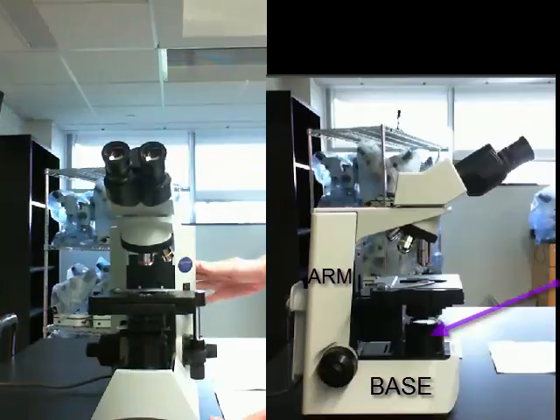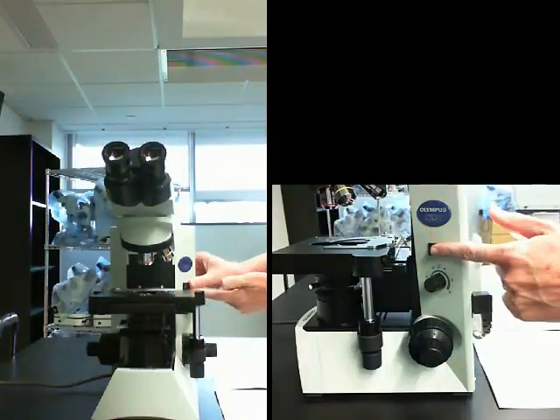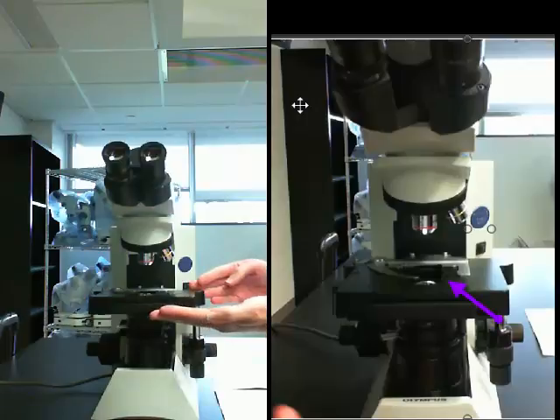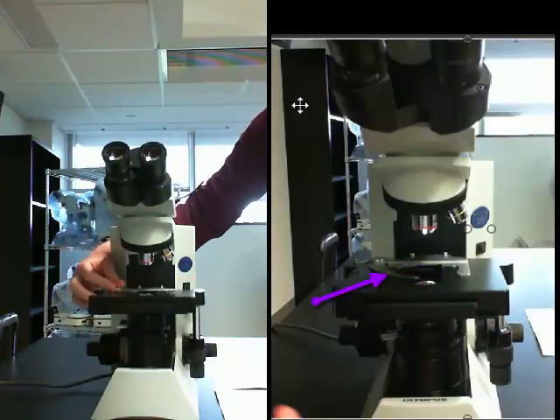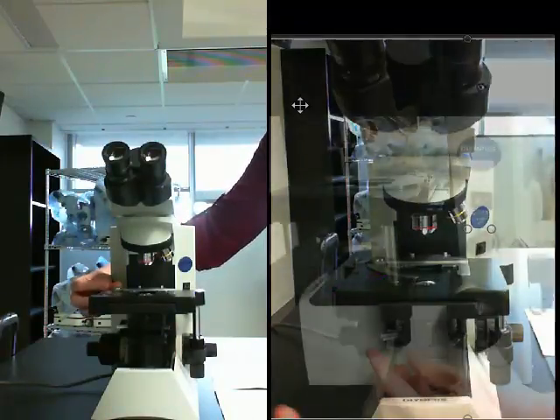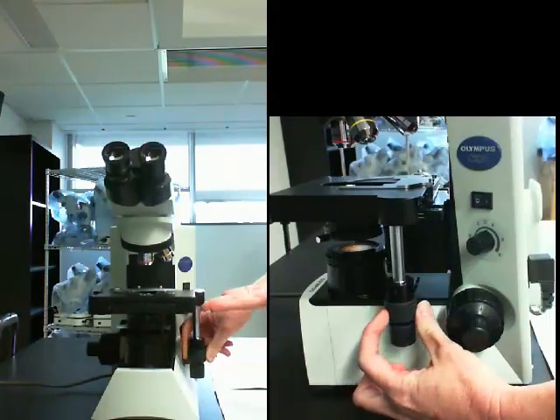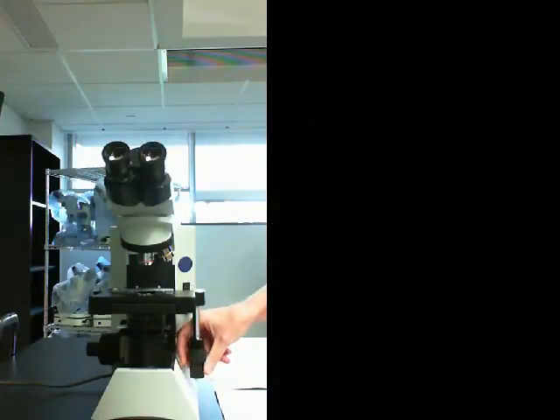Additionally, we have our light source, which is coming from down here at the bottom, but is controlled right here by this on-off switch. We have the stage, and this is where we're going to be placing our slide, and the stage clip right here that we can move with this lever for holding and positioning our slide. This also has adjustable knobs, which are down here, for moving the stage forward and backward relative to the light, as well as left to right.